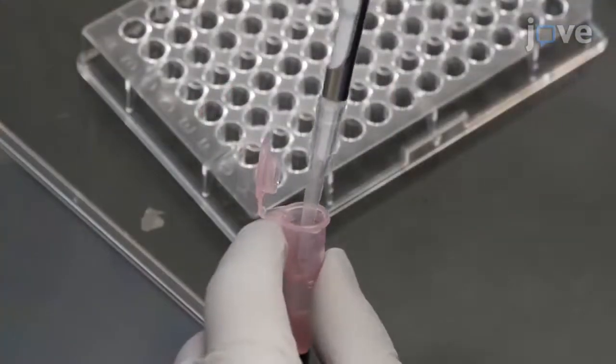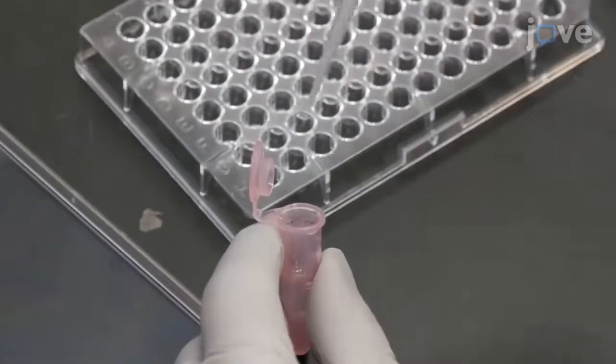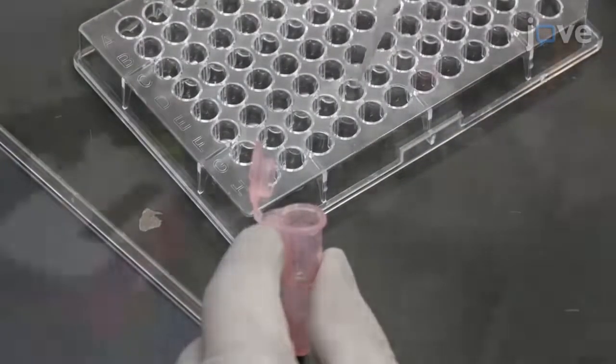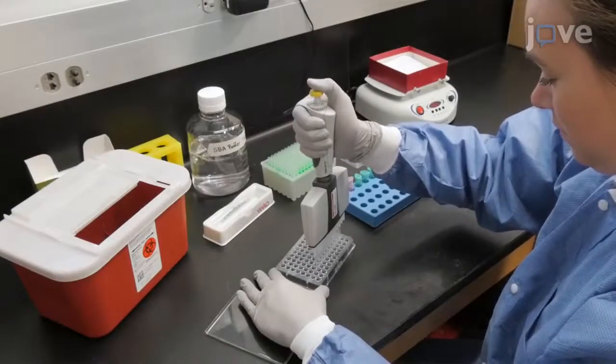Load 30 µL of each test sample in duplicate to row H of the assay plate. To begin performing 3-fold serial dilutions of the test samples, use a multi-channel pipette to remove 10 µL from wells 3H through 12H.